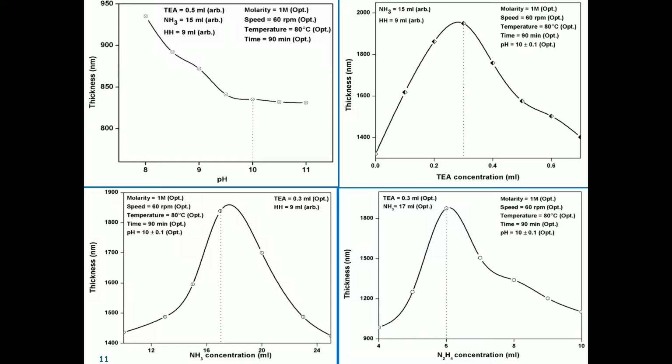Therefore, the role of ammonia in our case is to improve the layer sticking on the glass substrate.